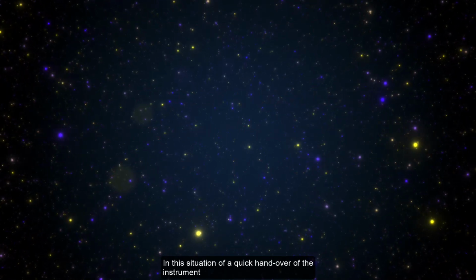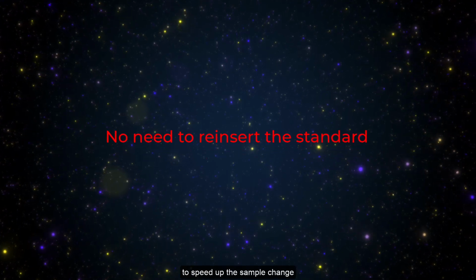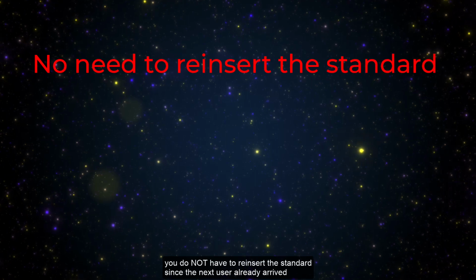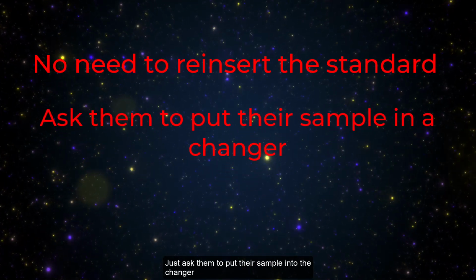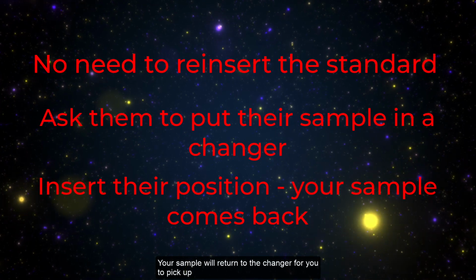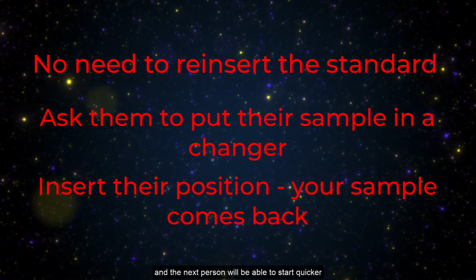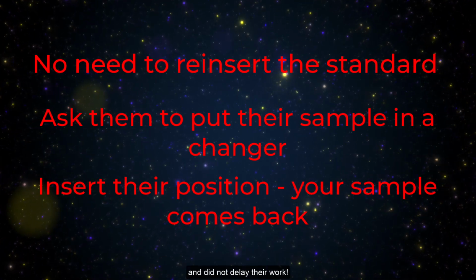In this situation of a quick handover of the instrument, to speed up the sample change, you do not have to reinsert the standard since the next user already arrived. Just ask them to put in their sample into the changer and insert that position into the magnet. Your sample will return to the changer for you to pick up, and the next person will be able to start quicker. They will appreciate that you did not make them wait and did not delay their work.